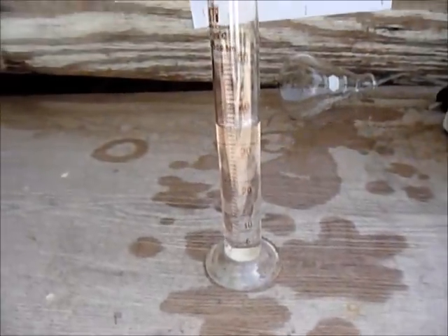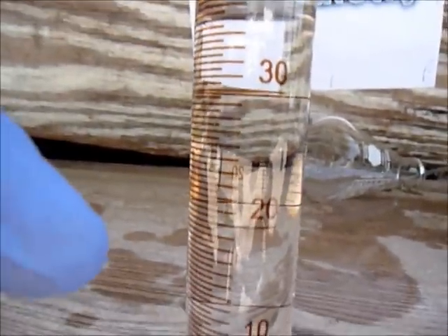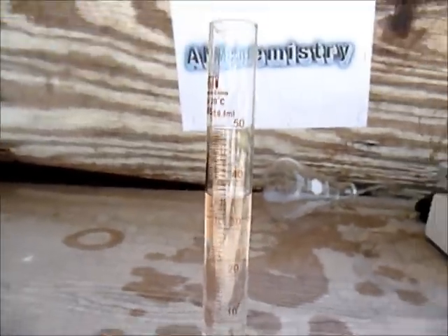This is the finished product. In volume, it went to about 35 or 38 milliliters — yeah, around there.